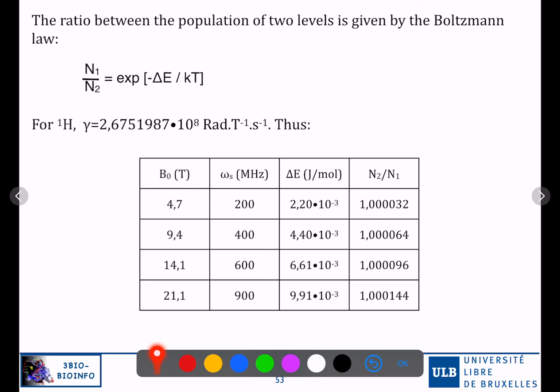It's about 0.1 Tesla, maybe 1 Tesla, but clearly not larger. The Earth also has a magnetic field. The magnetic field of the Earth is about 10 power minus 5 Tesla. So you see that a magnetic field of 21 Tesla is a very strong magnetic field.